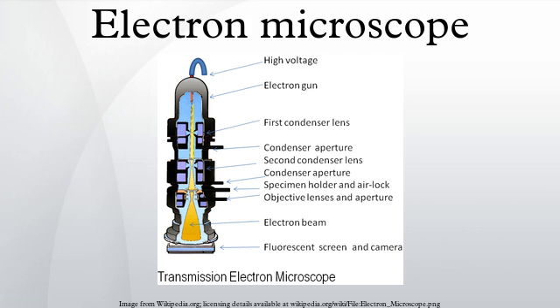Color. In their most common configurations, electron microscopes produce images with a single brightness value per pixel, with the results usually rendered in grayscale. However, often these images are then colorized through the use of feature detection software, or simply by hand editing using a graphics editor. This is usually for aesthetic effect or for clarifying structure, and generally does not add information about the specimen.